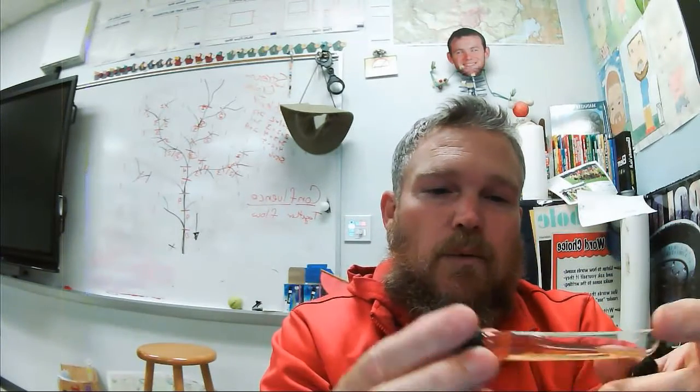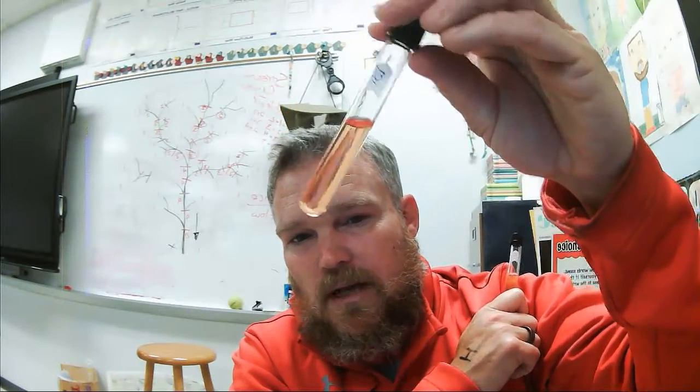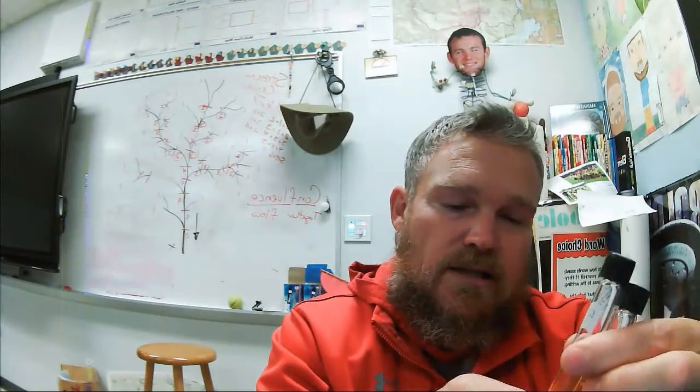So what we did was we went back to that same bottle filler the next day after we had this kind of positive test, right? And we got another sample, a little bit more careful that we didn't do any kind of cross-contamination, and after 24 hours we got this.